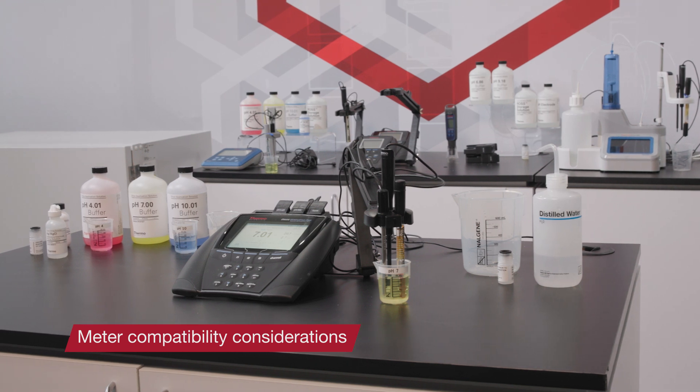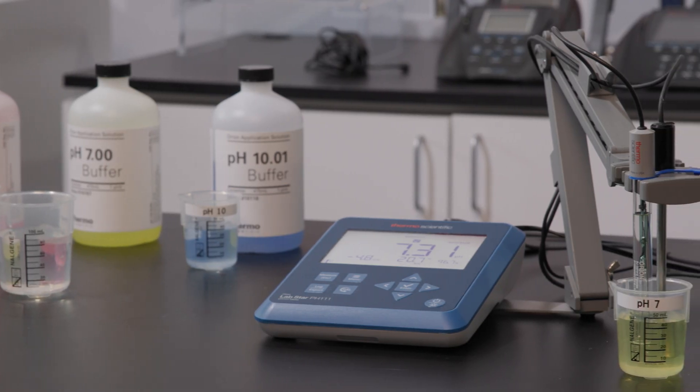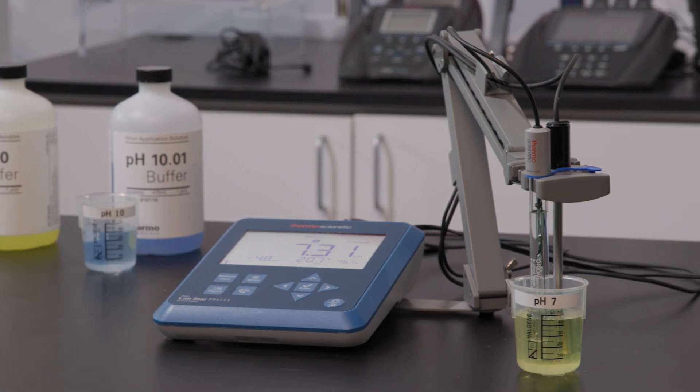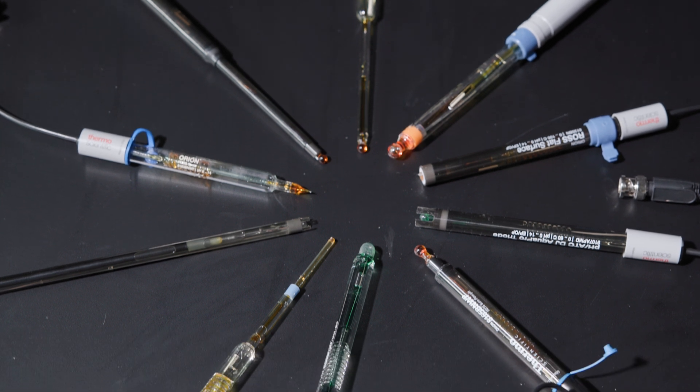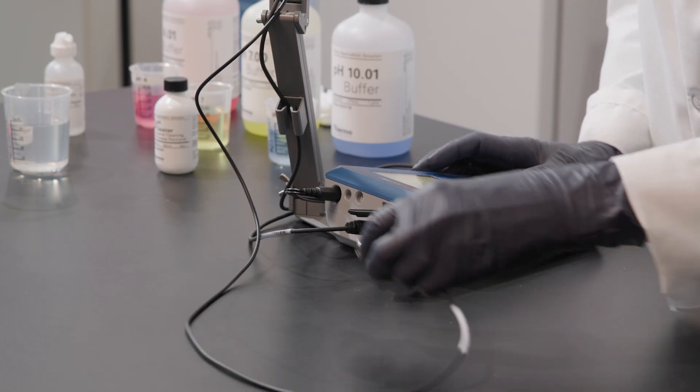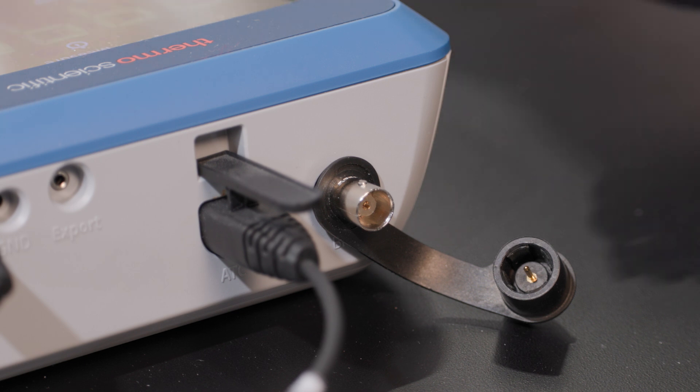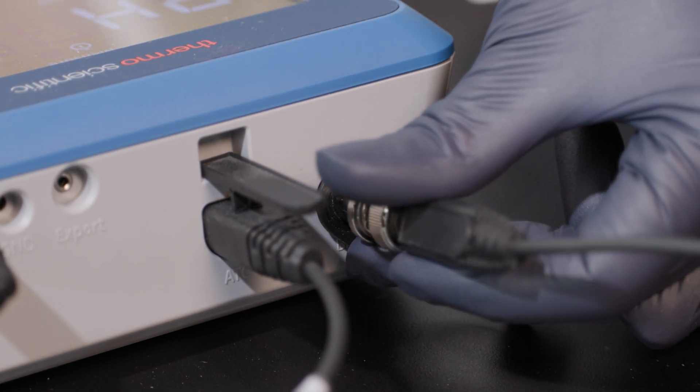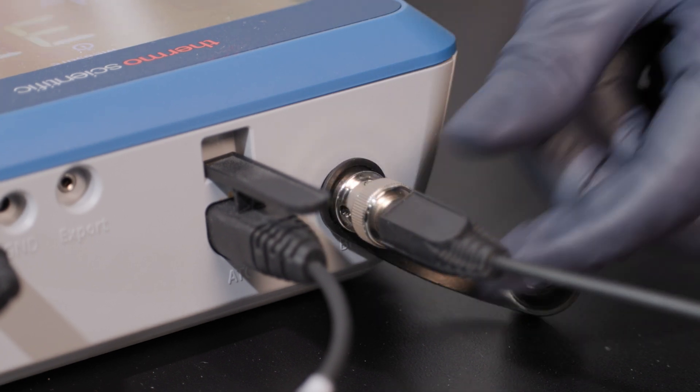A pH electrode is just one part of the pH system. Even with a good pH electrode, if it's not connected to a good pH meter, your readings may be compromised. Not all electrodes will work with every pH meter, so you need to determine that the electrode will connect to your existing meter. The Orion pH electrode family uses a BNC connector for pH electrodes, so they are compatible with all thermoscientific Orion pH meters.